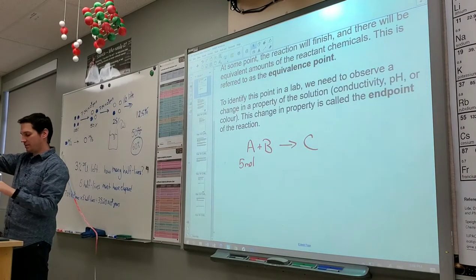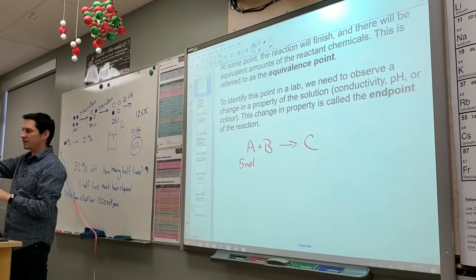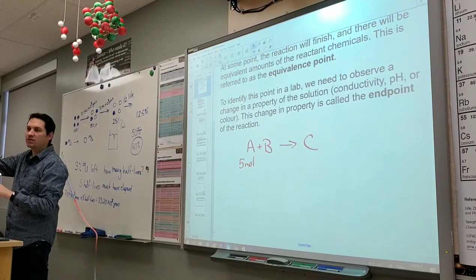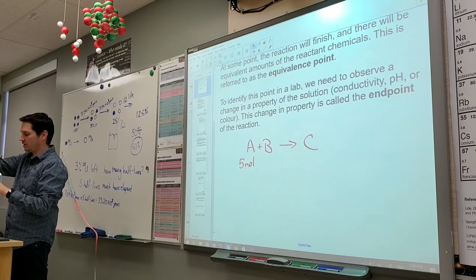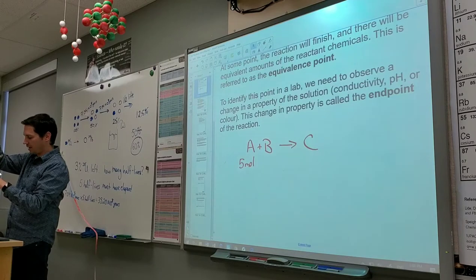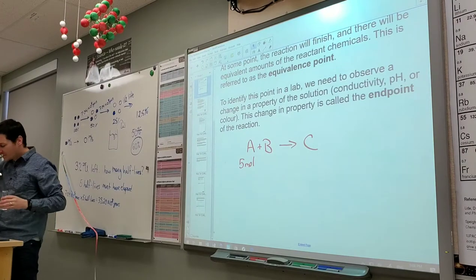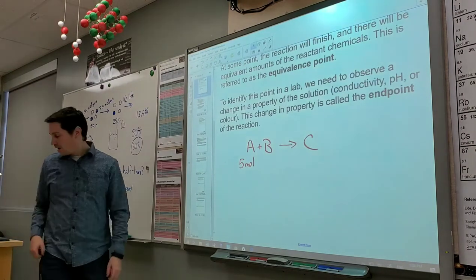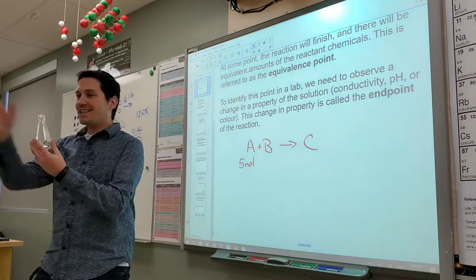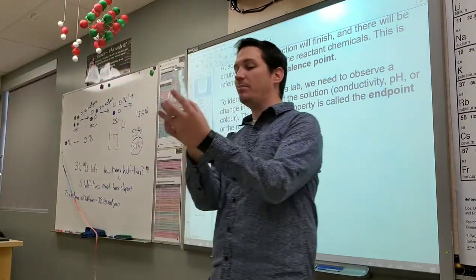How long did that take, Sully? 30 seconds. That's how long it should take to pipette a sample up. But that's fine if it takes you more; you're not as well practiced as other people are. I'm not going to blow out the excess in the tip. I'm just going to let it stay there. Perfect. So I pulled out exactly 10 milliliters of a base.